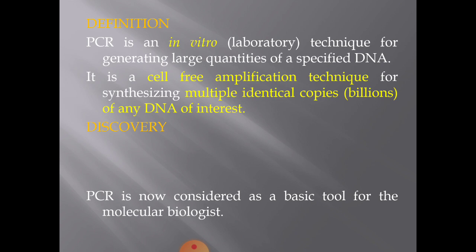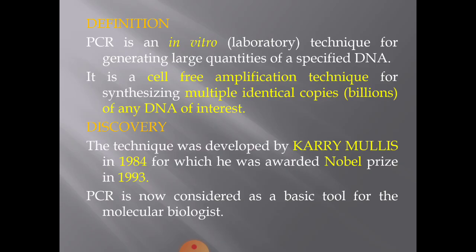So the moment I tell it is in vitro technique, I mean to say it is a cell-free amplification technique for synthesizing multiple identical copies of any DNA of interest. So billions of copies are generated within a short time. That is the significance of PCR. Now let us see when it was discovered and by whom.